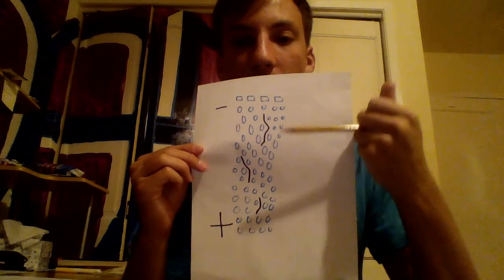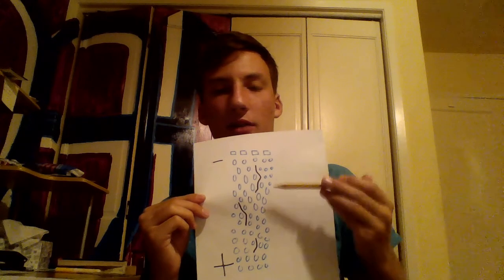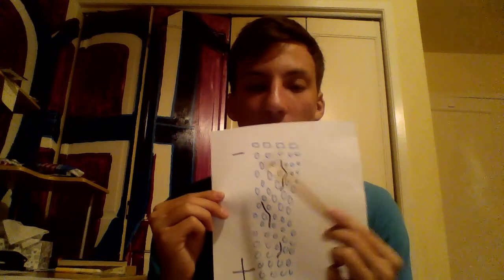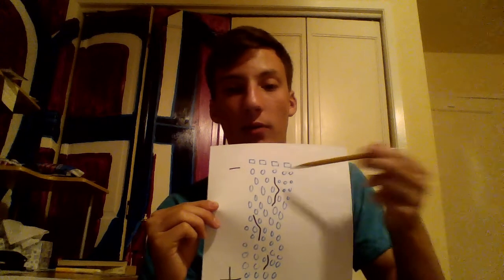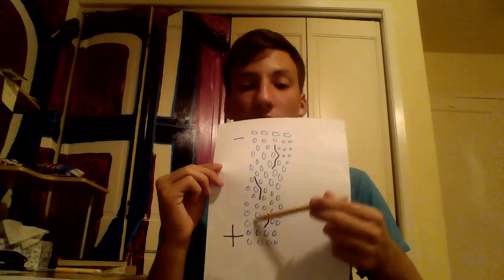And so what we want to do after that is run gel electrophoresis. So let's look at that here. We have this gel, which is represented by the blue, and obviously this is at a microscopic level, so you can see the individual parts, and these black lines are the DNA. One thing you'll notice is that there's a negative sign and a positive sign, and this represents the electrical charge. DNA is actually negatively charged. So when we put our PCR sample into the wells, it will run to the positive side.